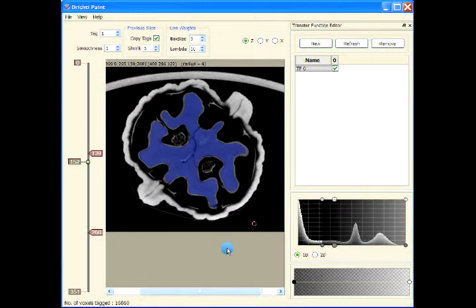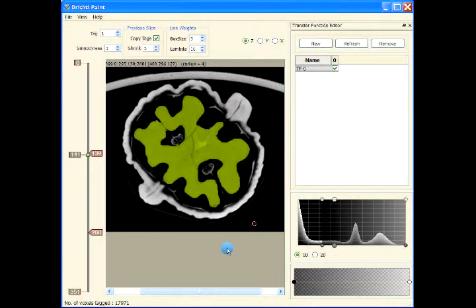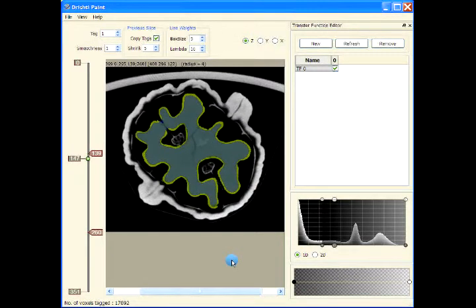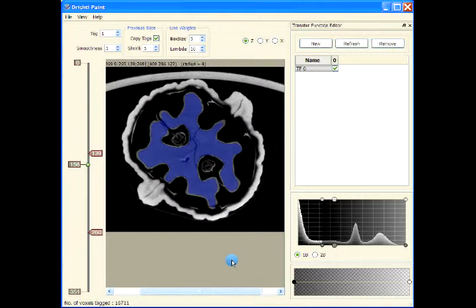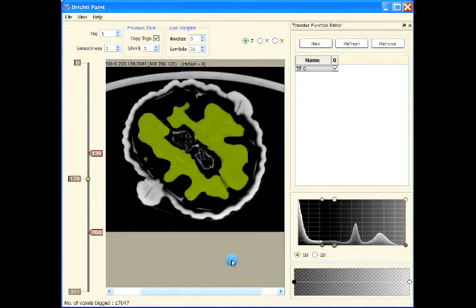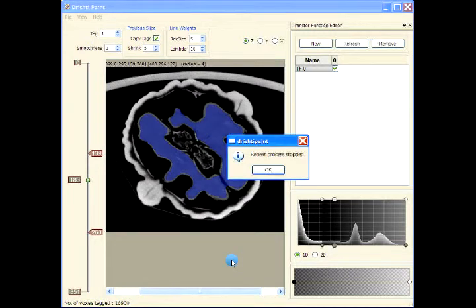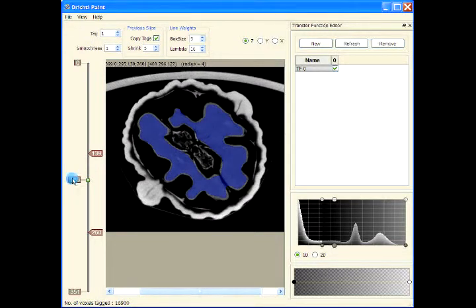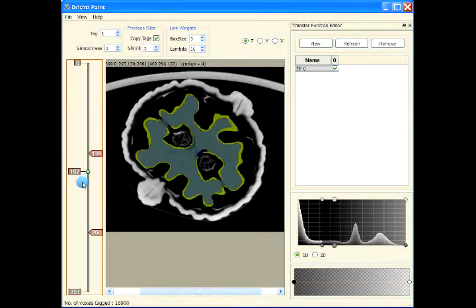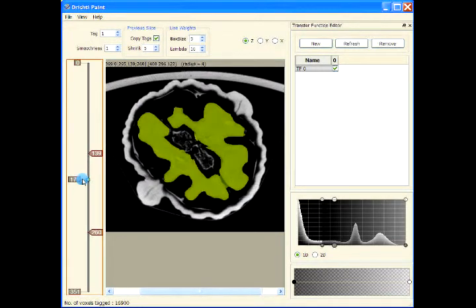Okay, and this is going automatically. You can also press Shift T again, forward direction, and I'm not pressing any key, and this is being done automatically, and I can press escape when I want to stop this process. So these are the slices, that's the information that is being tagged. Let's continue with the operation.